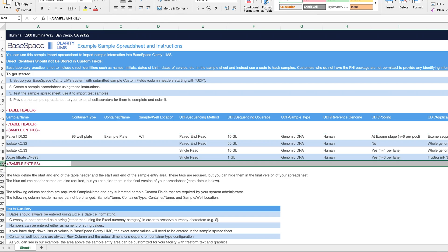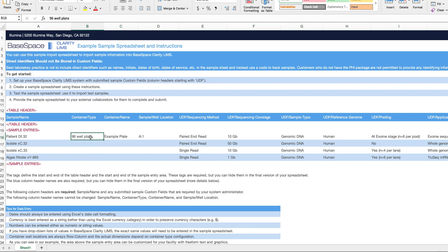You can add as many samples on this template as you want, as long as they are in between the tags. If you are submitting samples on a 96-well plate, your container needs a name and a well location.